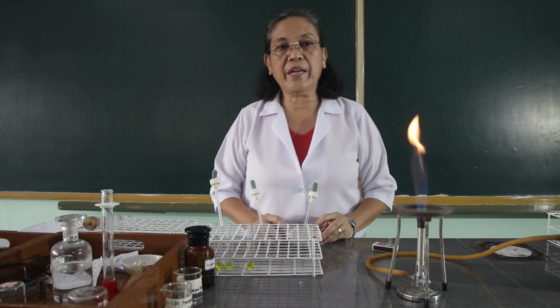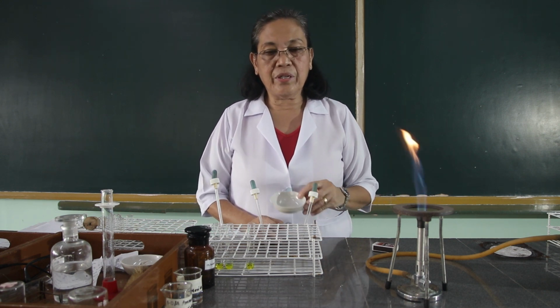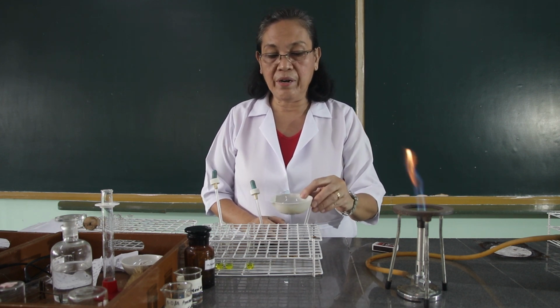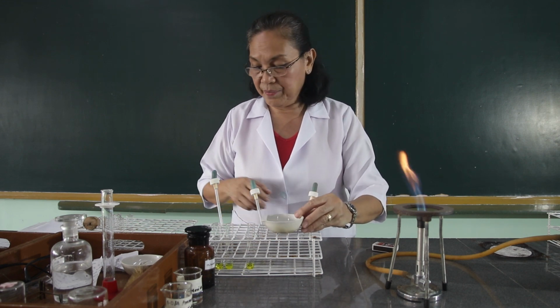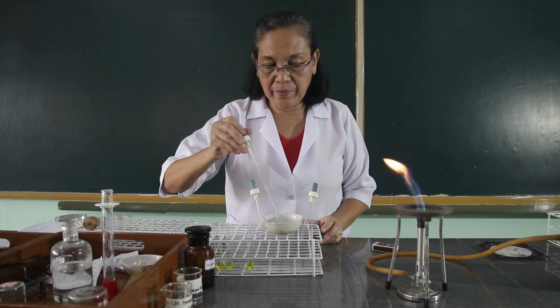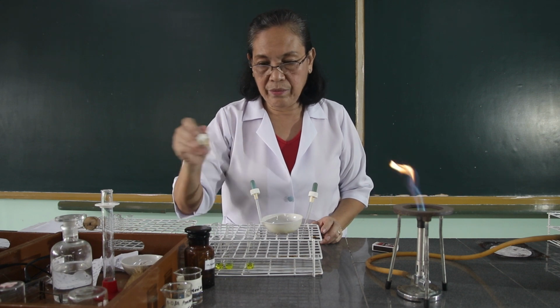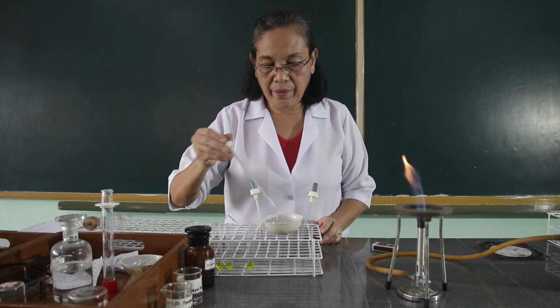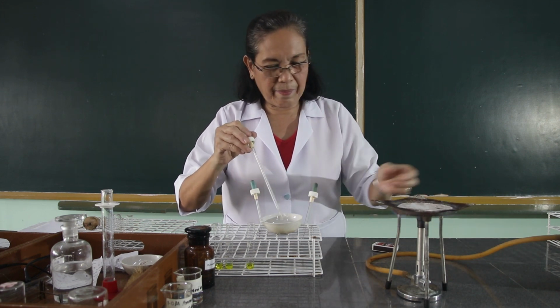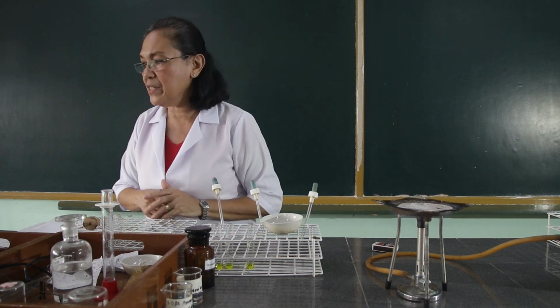The next procedure is to test the presence of the ammonium ions. So in here, we're going to put 3 ml of the ammonium chloride into the evaporating dish. One, two, three. And let's add it with 1 ml of sodium hydroxide.